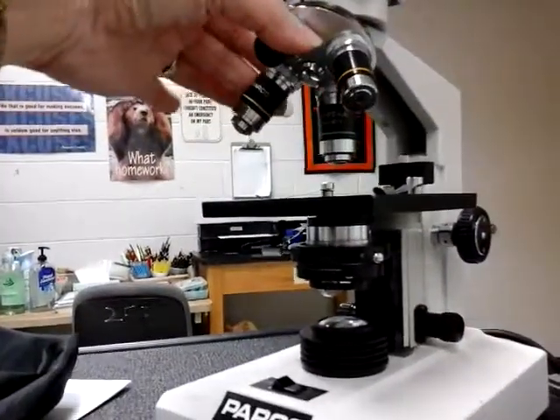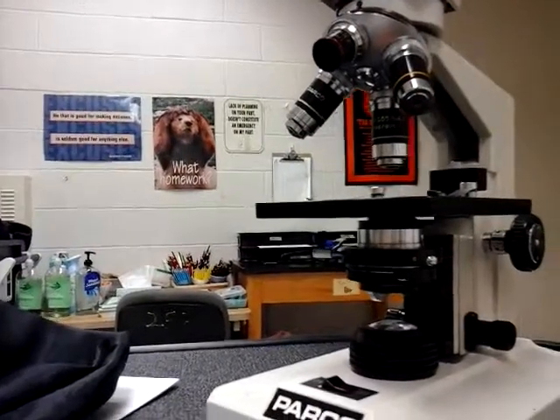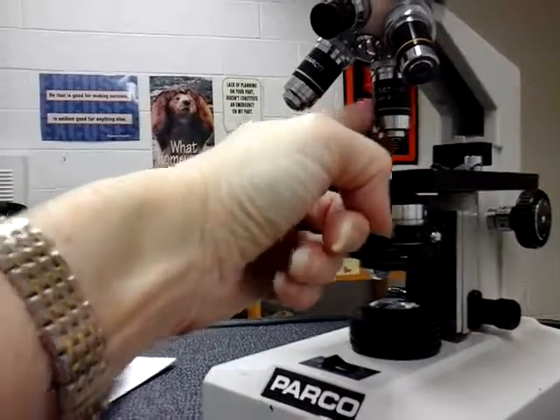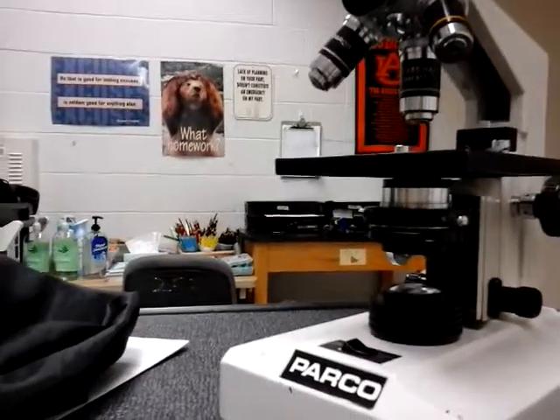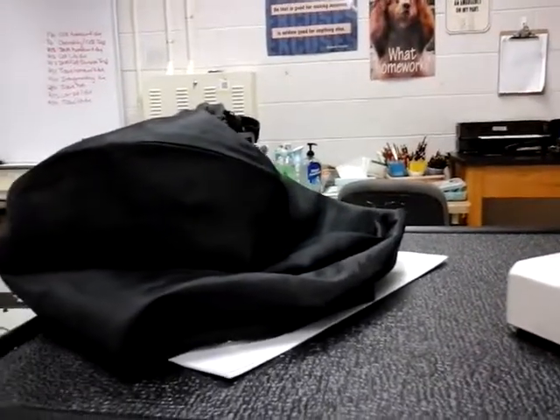And then when you flip to what we call blue power, that is high power. So somewhere on your sheet, write blue equals 40. This thing alone will magnify things 40 times. So when you're on blue power, you're actually magnifying things 400 times.